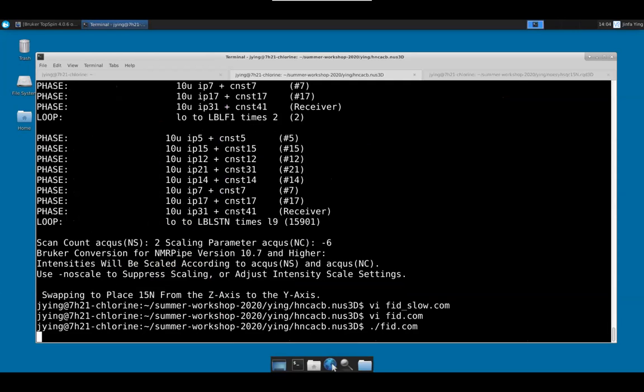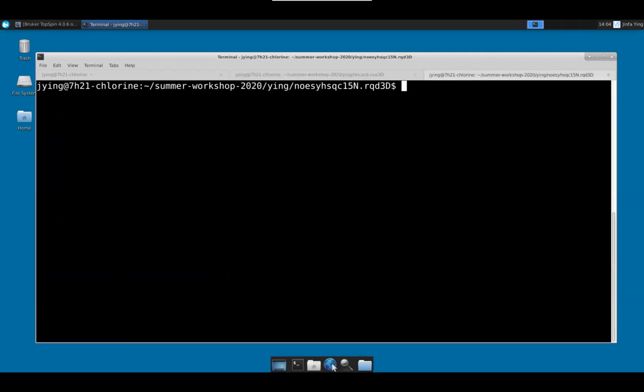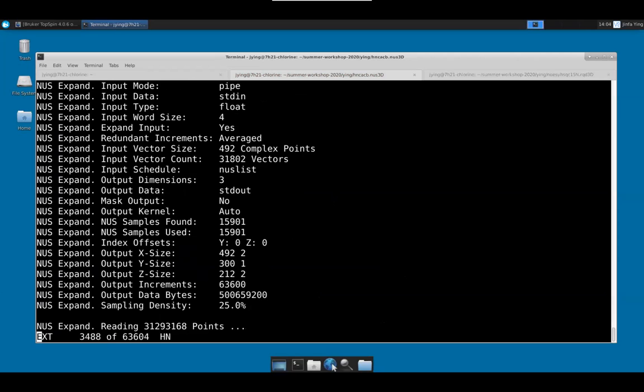Oops, not so fast. Why is there nothing? Oh, I think I set all the verb to 0, so there's no information out of here. Okay, but if you run the other one, I'll tell you it will be a lot slower than this. Okay, so it's done. Oh, yeah, so the conversion even takes a little while, and now it's doing expansion. Okay, so let's leave it.